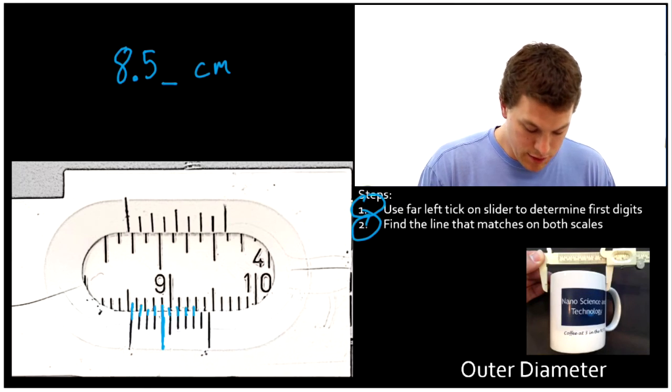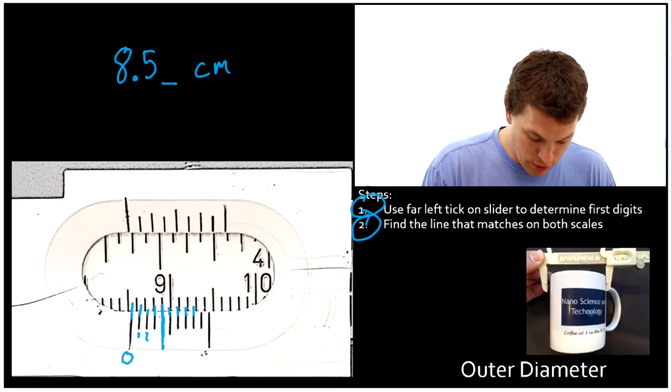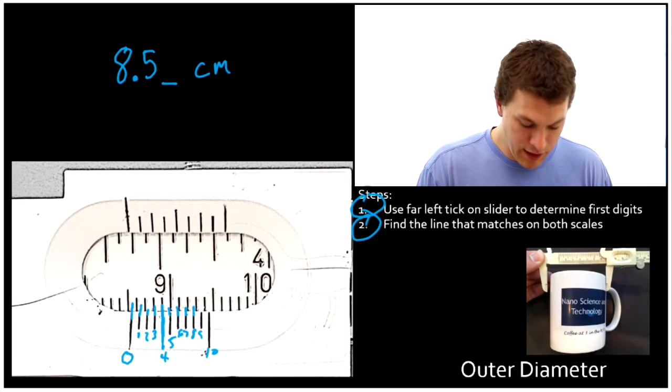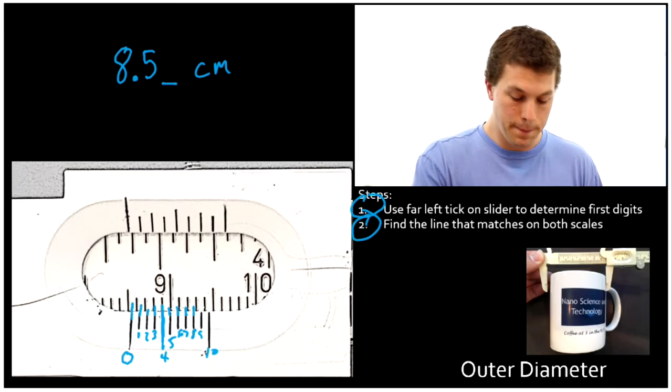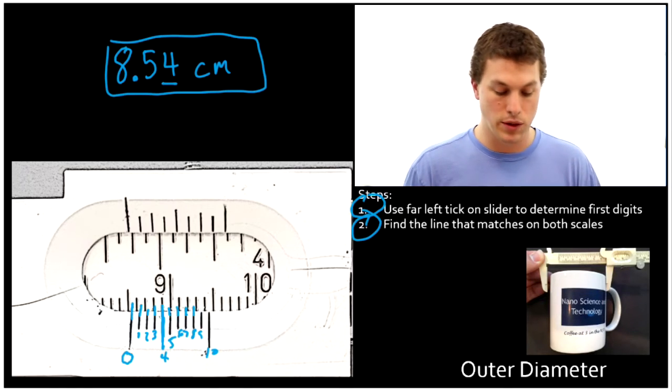Now we're going to number them. So the numbers on the vernier scale go 0, 1, 2, 3, 4, 5, 6, 7, 8, 9, and then finally 10. Since our fourth one lines up, we're going to write a four right there. So our measurement is 8.54 centimeters.